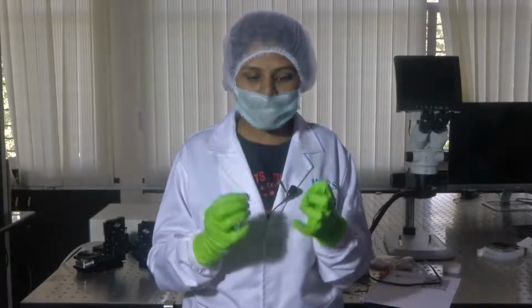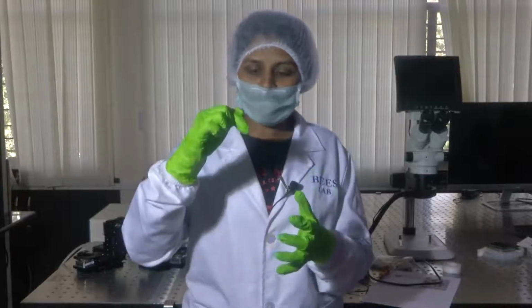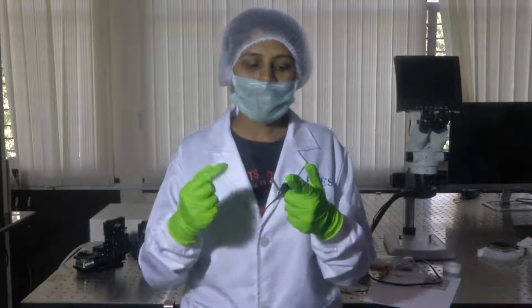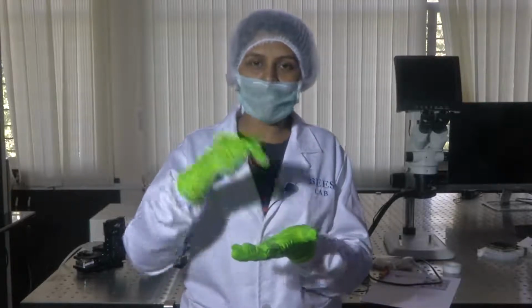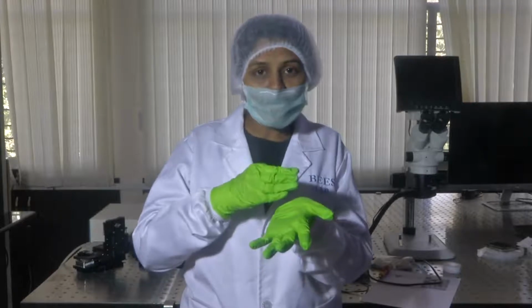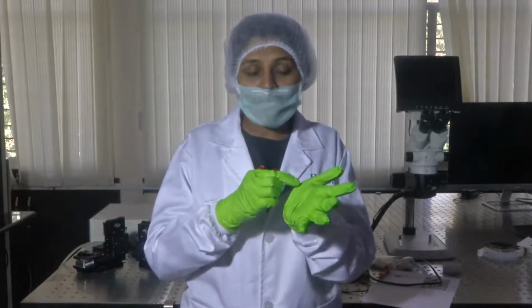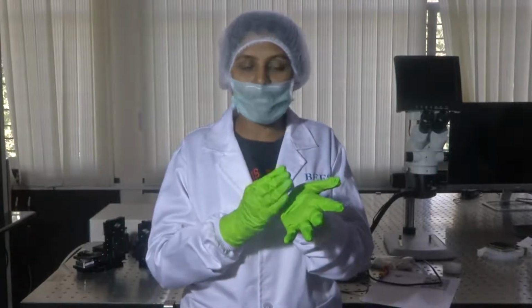Say you want to indent a cell or a tissue, and in order to indent them, you cannot use a simple indenter. Say you have fabricated a tip with an indenter, and you are trying to study them. With these indenters, you cannot precisely apply the force, you cannot move them in the XYZ direction very accurately, and they are not repeatable. Say you have done it once, the same thing cannot be repeated the next time.